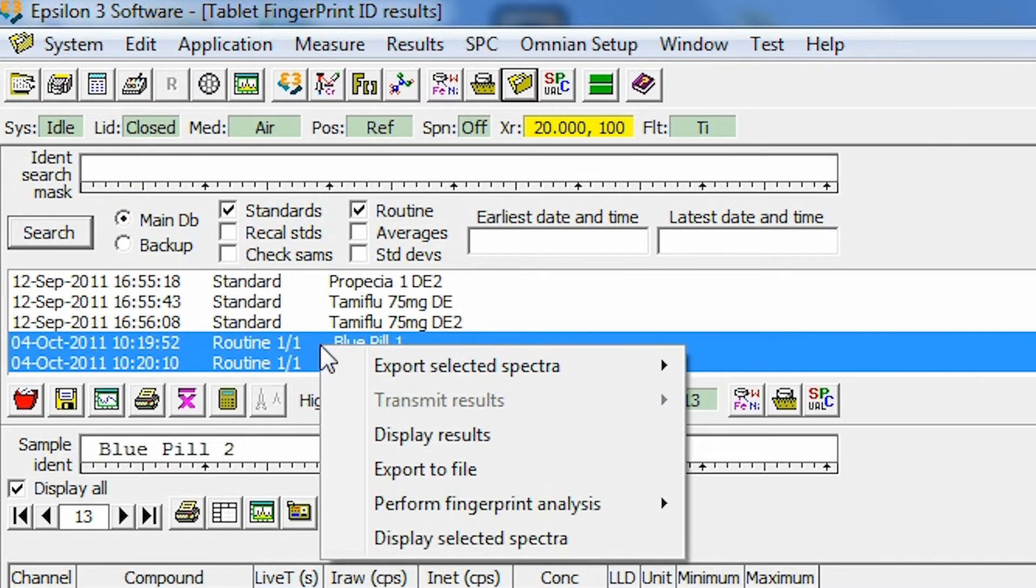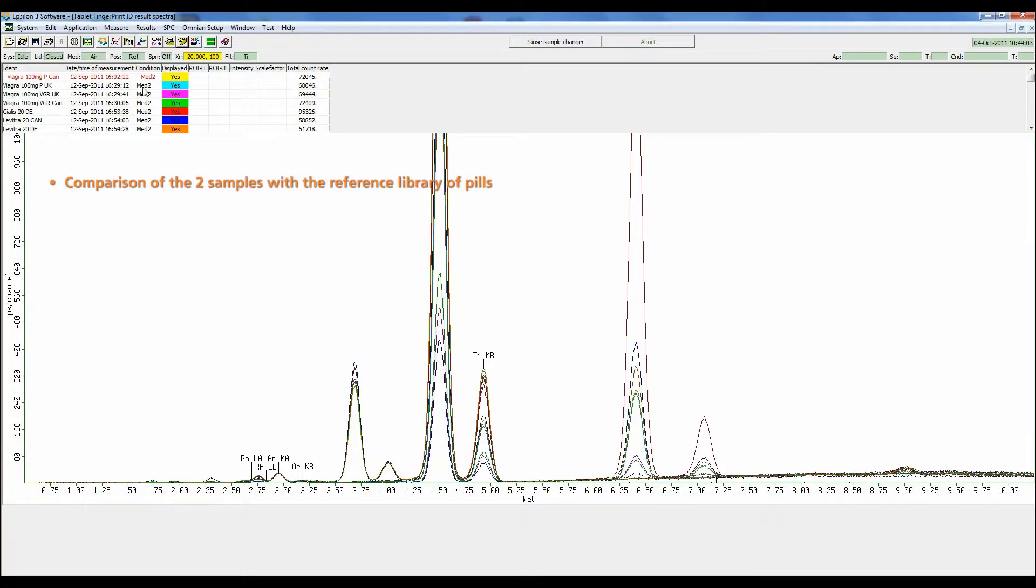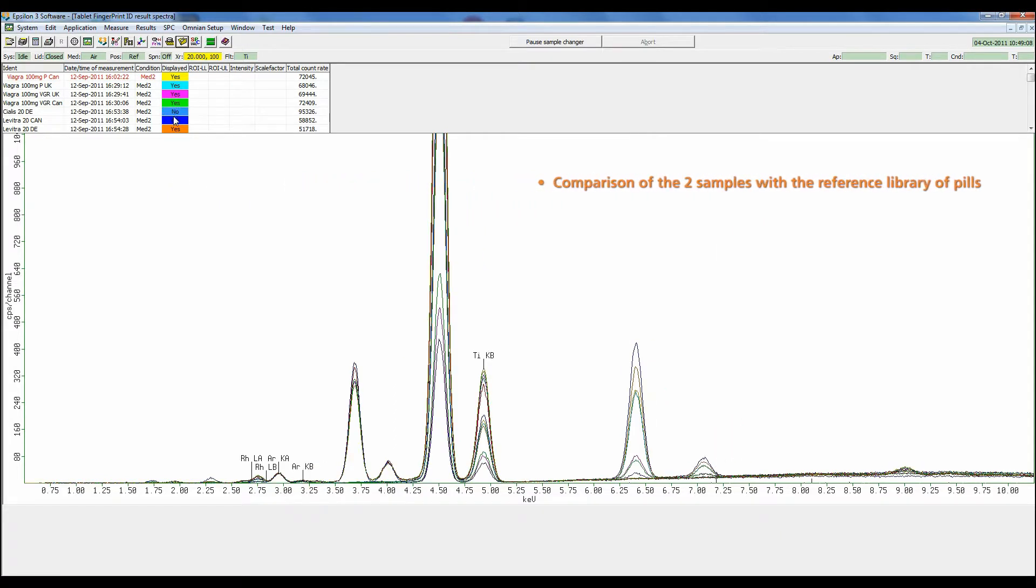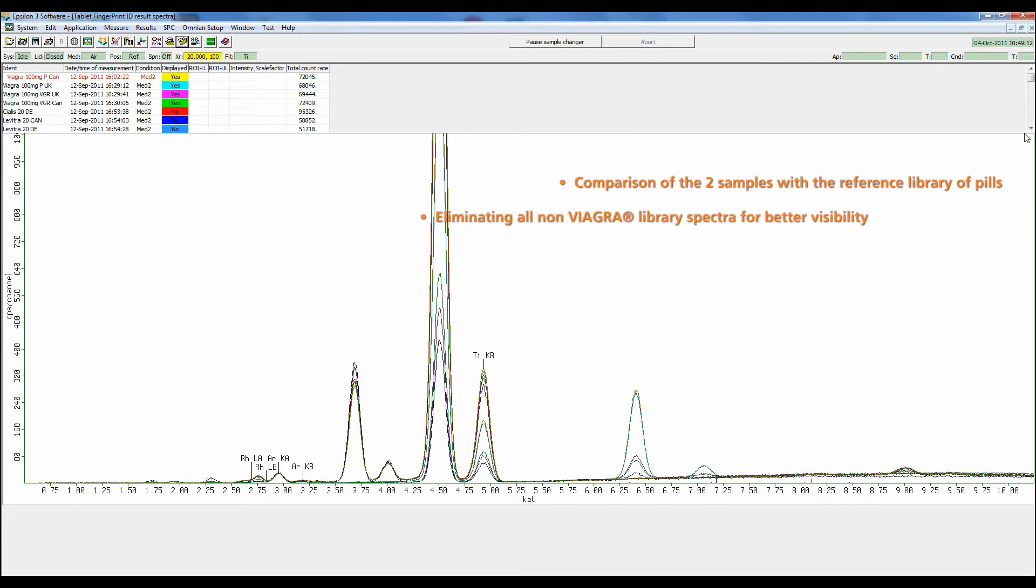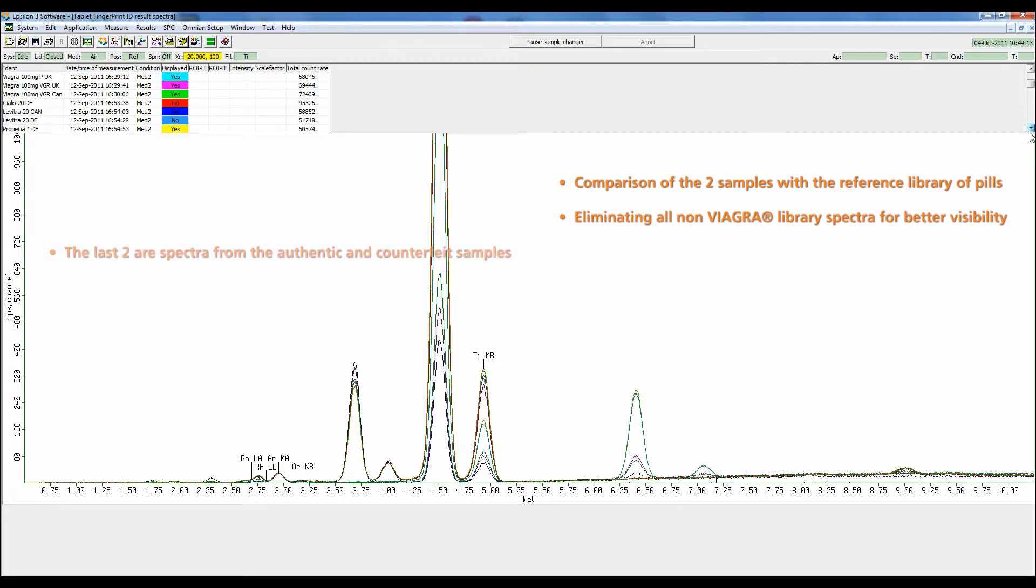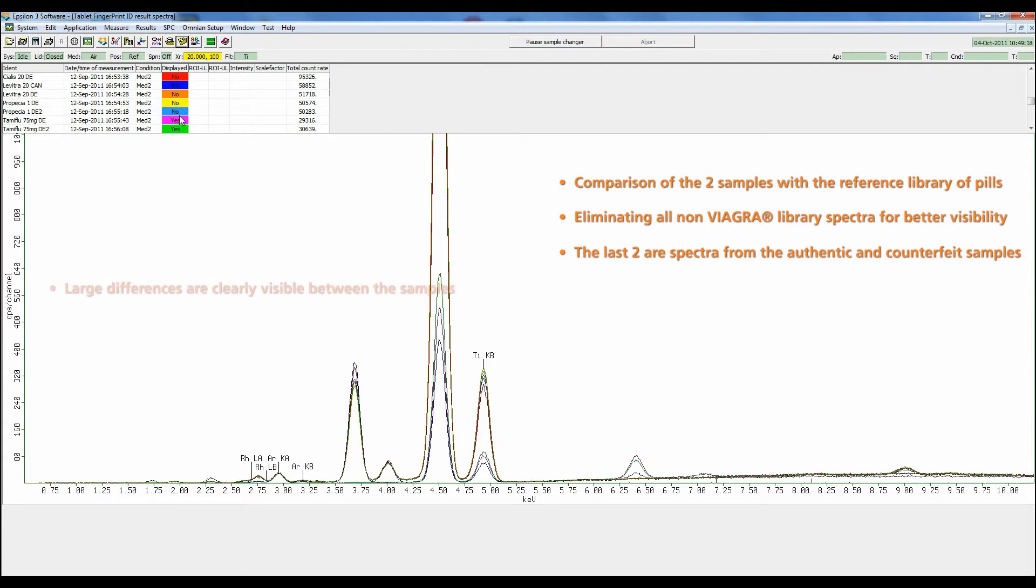Now if you want to see the differences visually, we can compare all of the spectra from our samples and our references. We'll keep the Viagra spectra and eliminate the other pills. As we get closer to the Viagra only, we'll see a tightening of the spectra until we see our two examples.